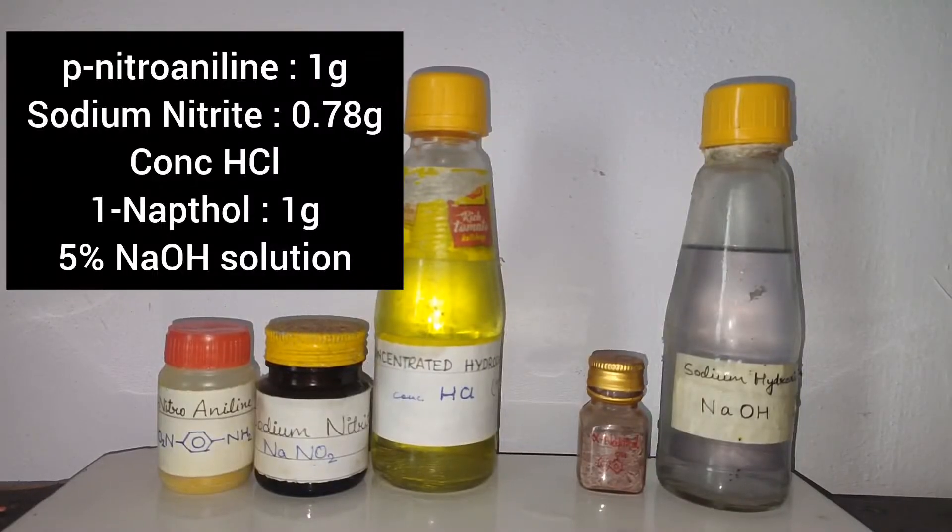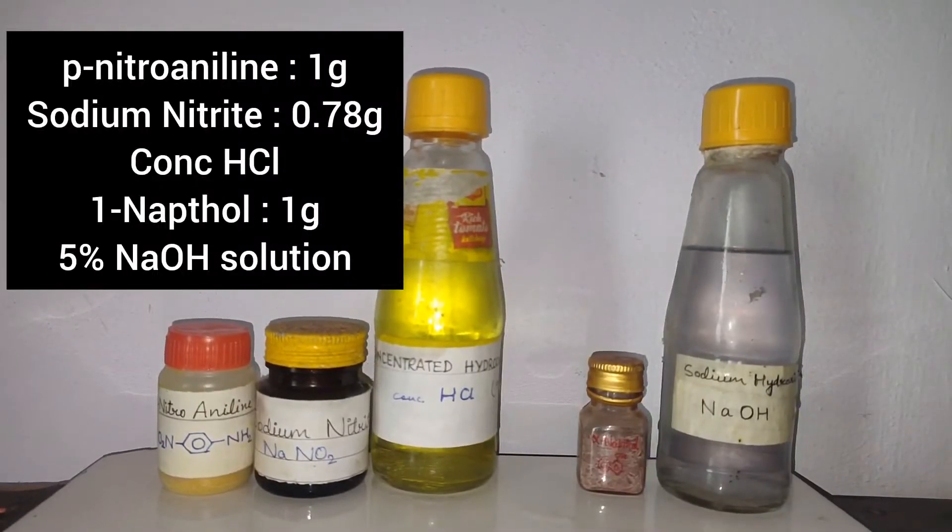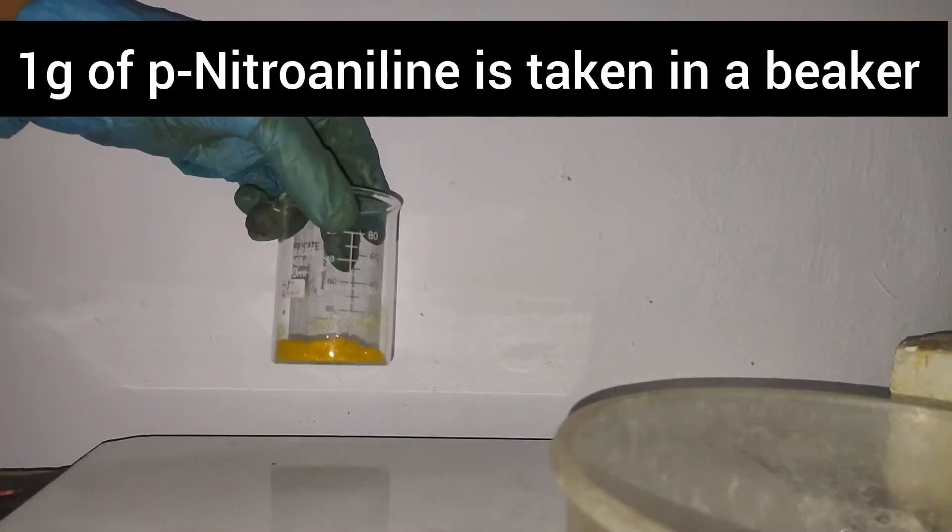In this video we are going to make Magneson 2. For this we need para-nitroaniline, sodium nitrite, concentrated HCl, 1-naphthol, and 5% NaOH solution.